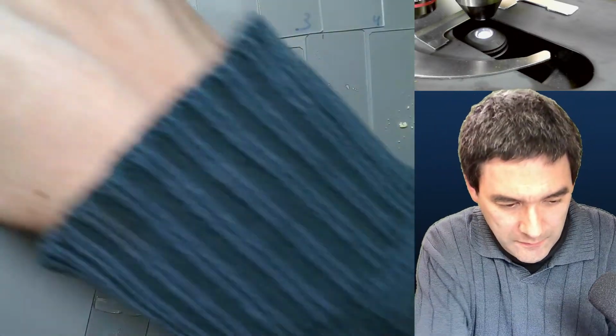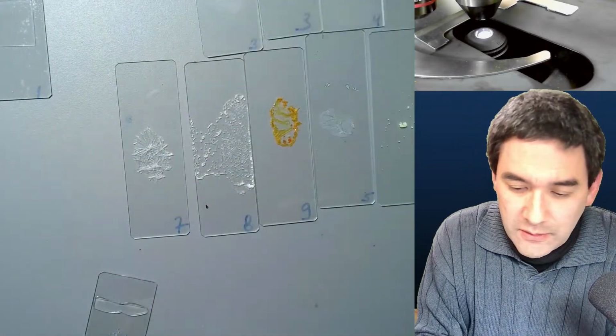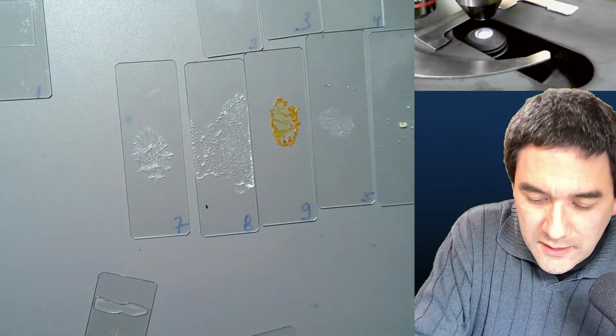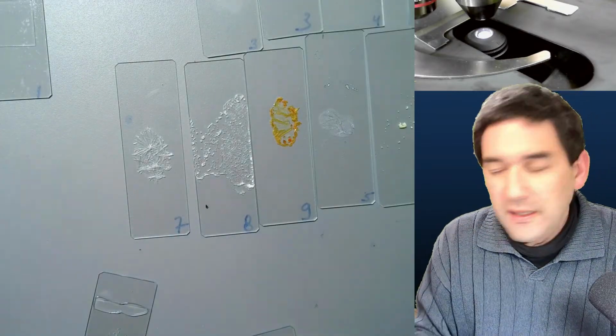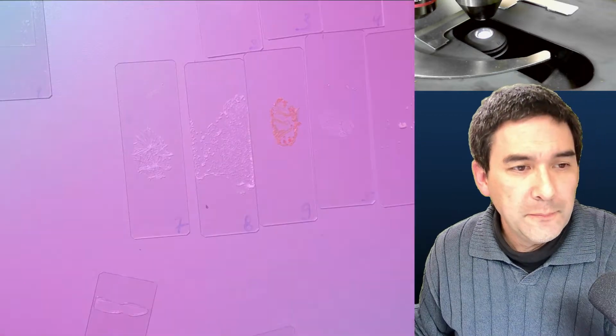So number 1. So this one over here, number 2, is vitamin C. We just had a look at this. We also made a slide of this here, and let's see how this slide is doing right now. Okay. So this is again the ascorbic acid, the vitamin C. Look, the crystals, some of them start to show some corners now. This basically means that crystallization is starting to take place.